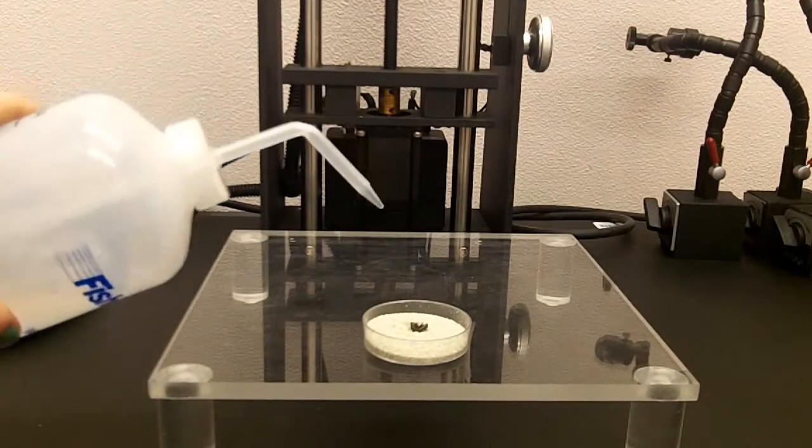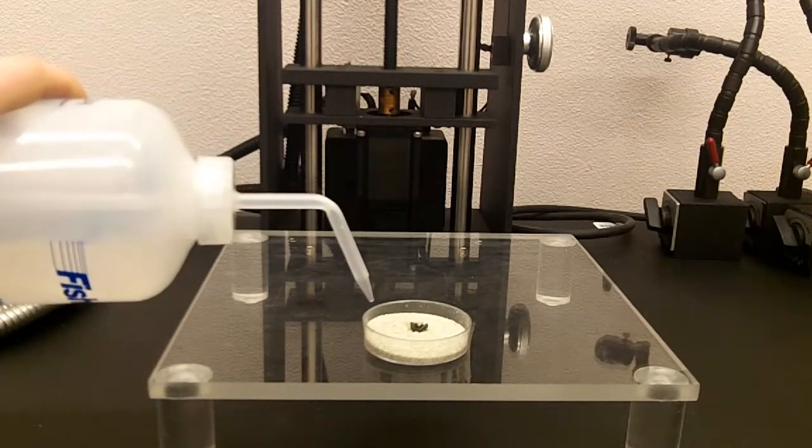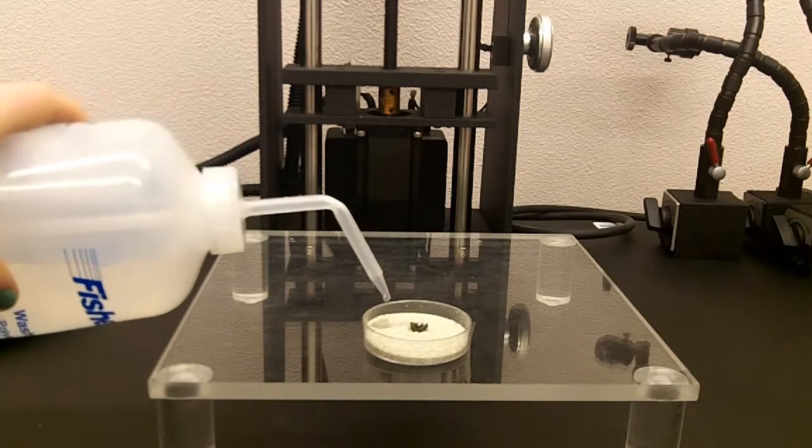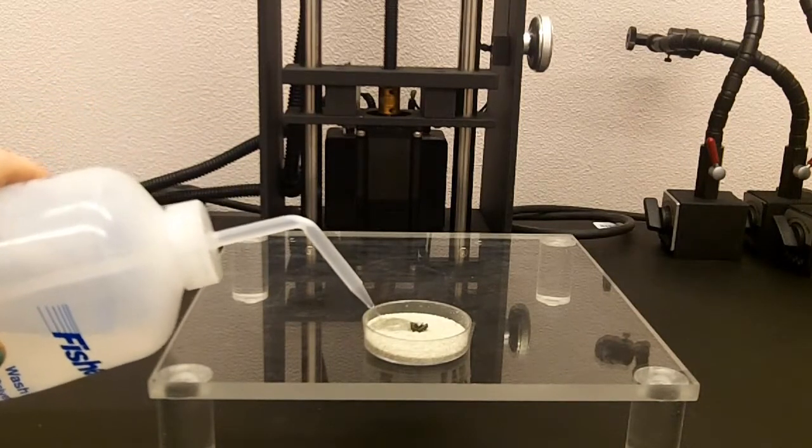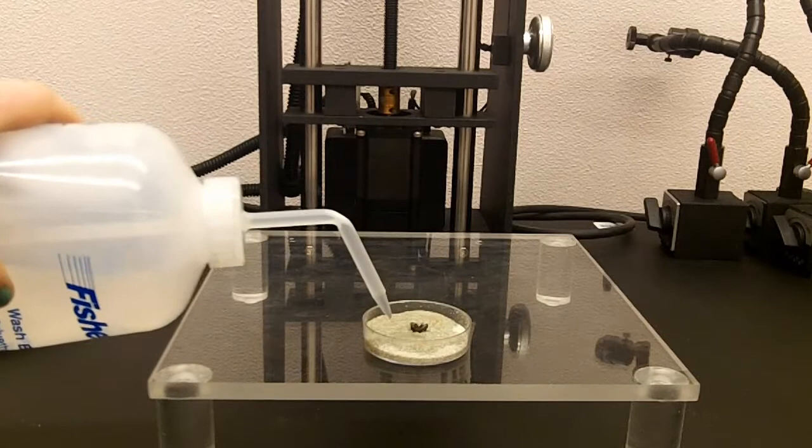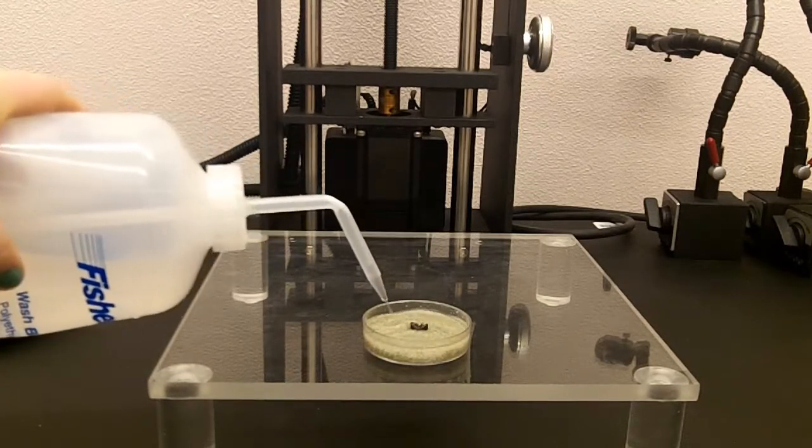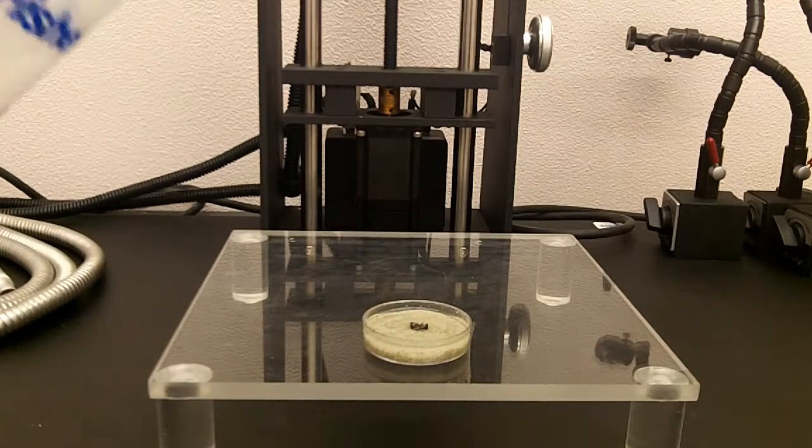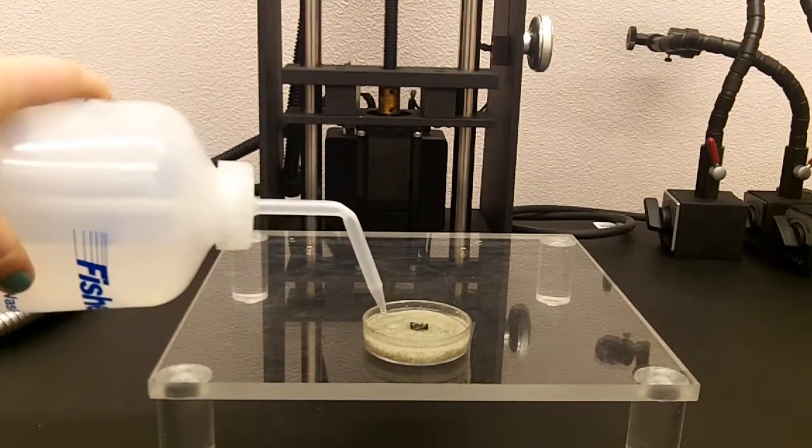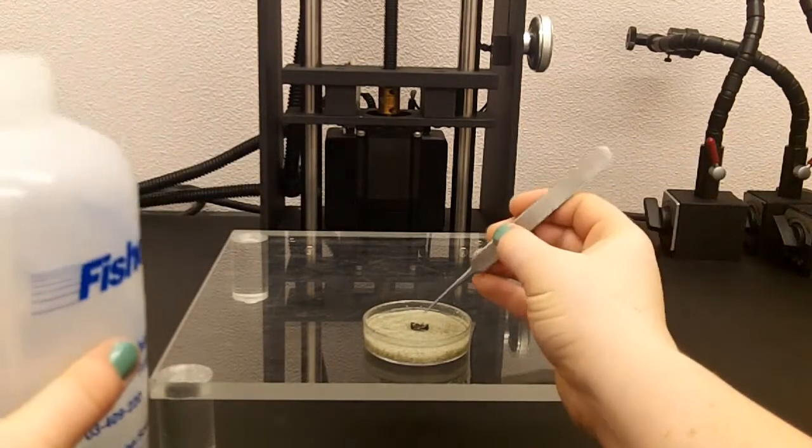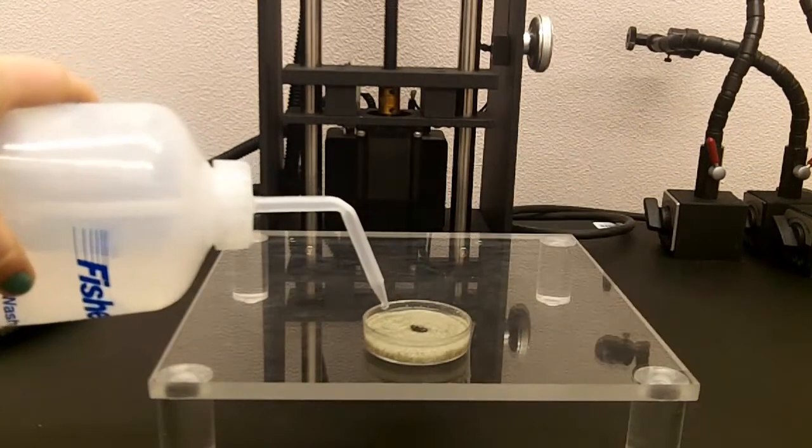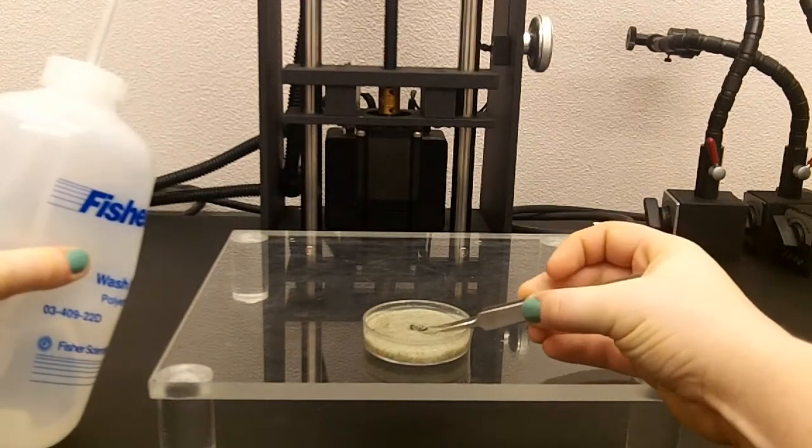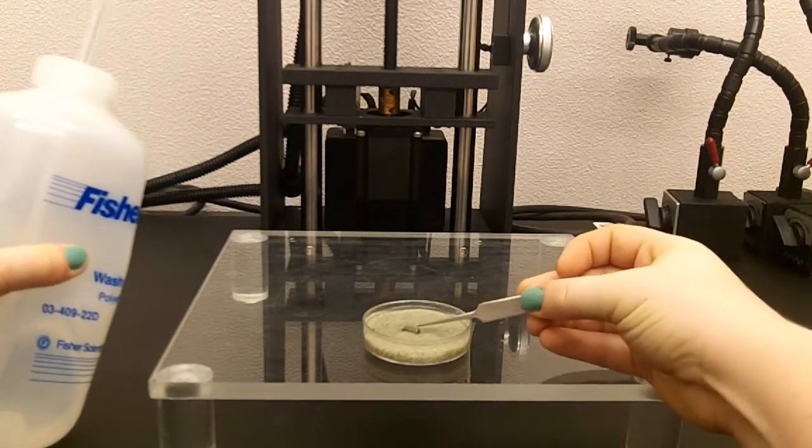You could either fill up the petri dish with ethanol first and then put the specimen in, or do what I've done where I'm putting in ethanol after I've settled the specimen. So you want to fill up the petri dish with enough ethanol so that it completely covers the specimen, but not too much ethanol above the specimen where it will start to distort the specimen in the image.